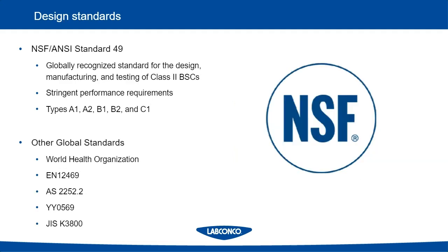Okay. Now, when it comes to our manufacturing design standards, Labconco manufactures various types of Class I and Class II biosafety cabinets, as well as other manufacturers make these cabinets. How do we know how we need to make these cabinets? So we are held to a standard that we all refer to as NSF 49. This standard is put out by NSF and ANSI International, and this standard relates to how we design, make, and test our biosafety cabinets.